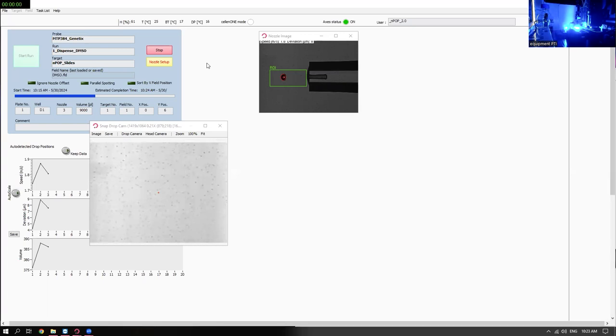So I wouldn't suggest having them on ice for hours. You can degas small volumes of these under vacuum for 5 or 10 minutes. That typically will reduce the oxygen concentration enough that you don't experience that when it warms up.